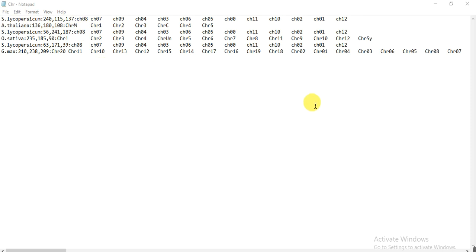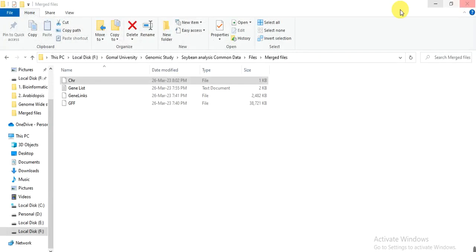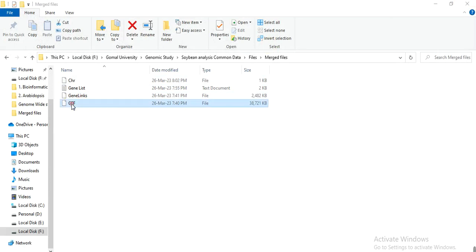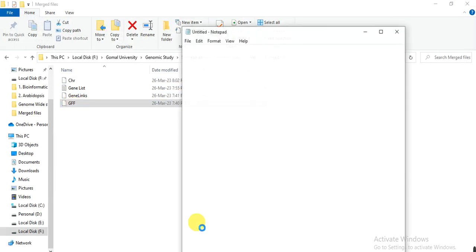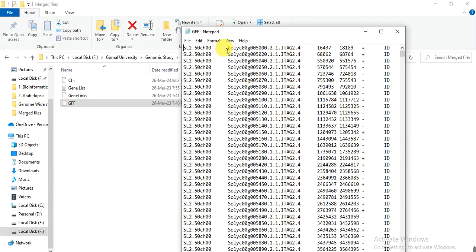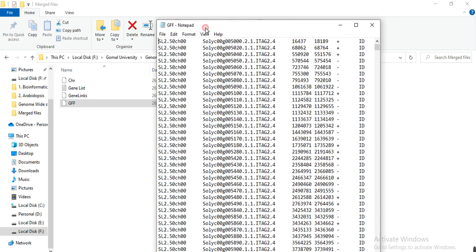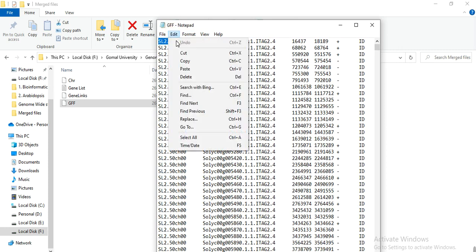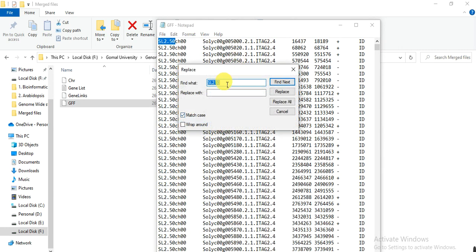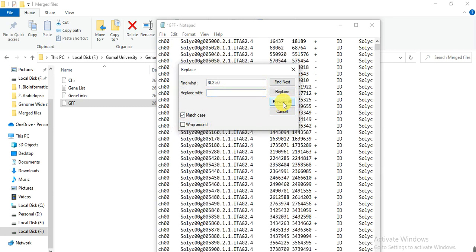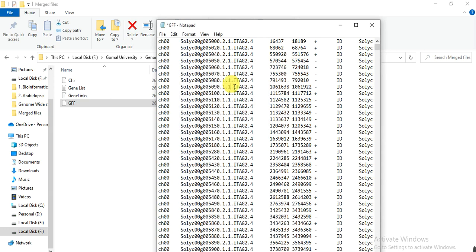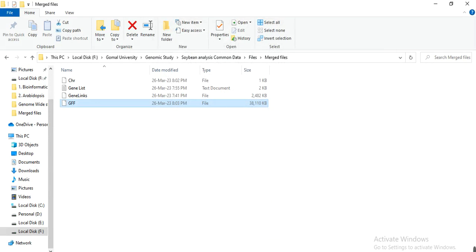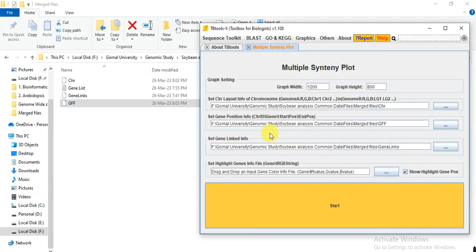Open the GFF file. And here also delete the SL2.50 prefix using find and replace. So we have that name corrected. And save. And then go to multiple syntenic plot.